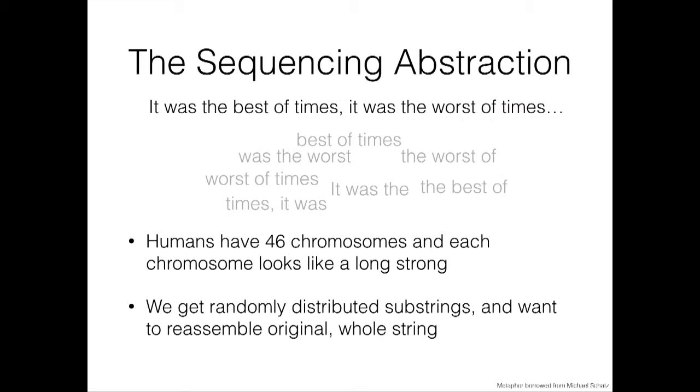I expect that there aren't going to be that many people here who are familiar with genomics. So I'll start out by taking you through a brief walkthrough of what we're doing in genomics and what some of the processing that we're interested in is. What we're looking at here at Berkeley is a process we call variant calling.